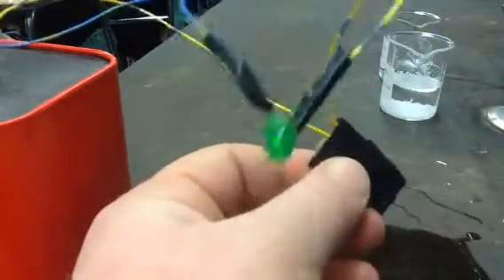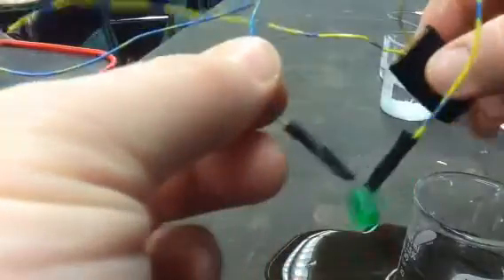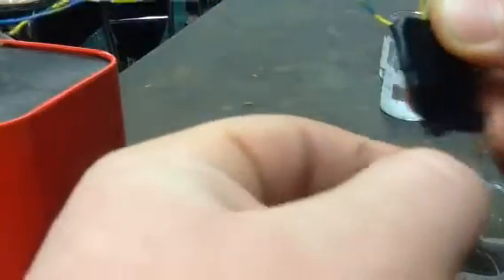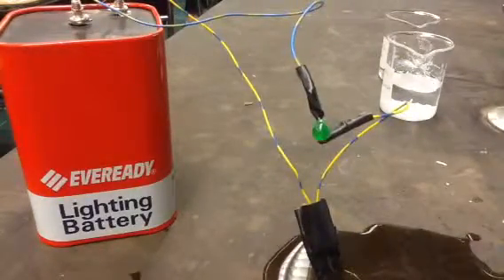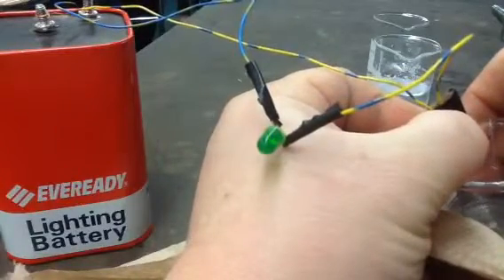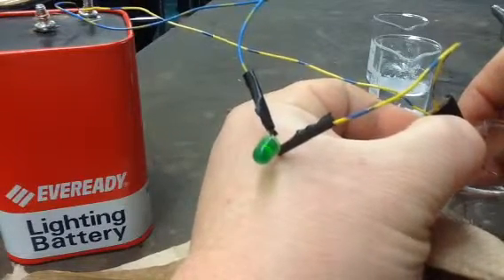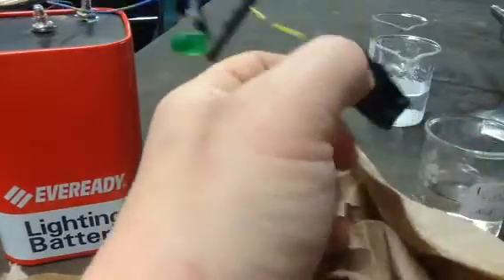We'll go to citric acid. Let's rinse our probes. Okay, not lit. And probes into the citric acid. I think my wires are touching. Some paper towel here. A big mess that I'm making. Let's wipe off my probes. Okay, so we get non-conductive for citric acid. Every now and then you get a little weak glimmer of conduction. Very weak. But overall, we would say citric acid is non-conductive.